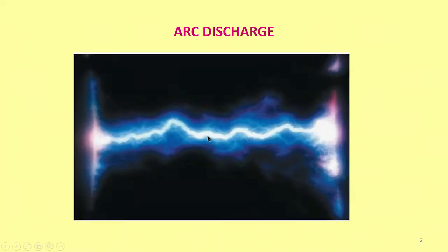At some stage there will be attraction between the two electrodes, and a spark, a zone will be generated, and the electric current will pass through this range, and you must have seen this in your day to day life, especially during rainy season in the skies. Okay. So, it is nothing new, it is like lightning.